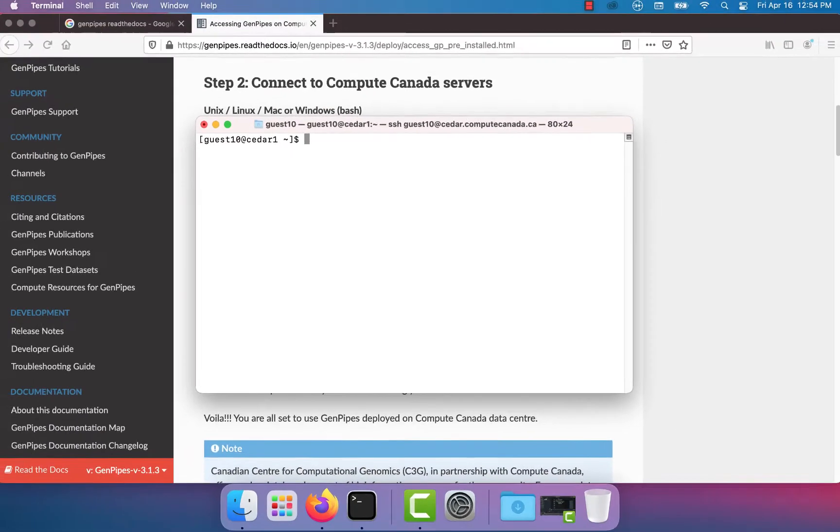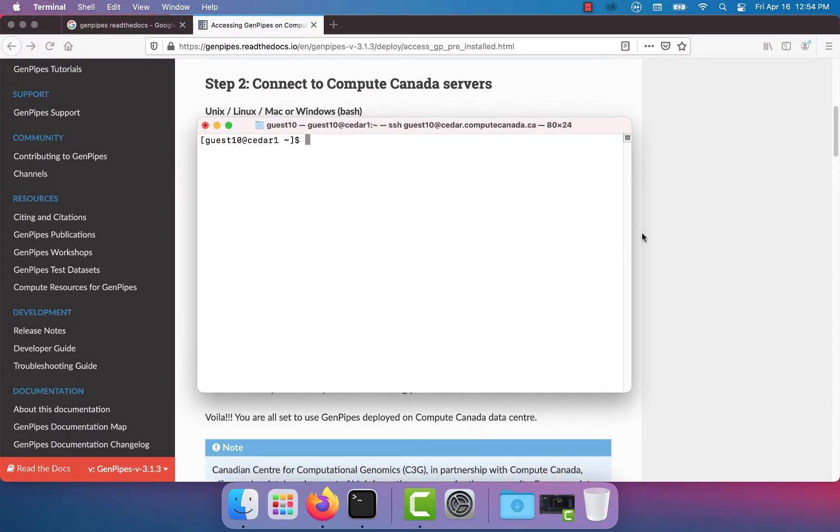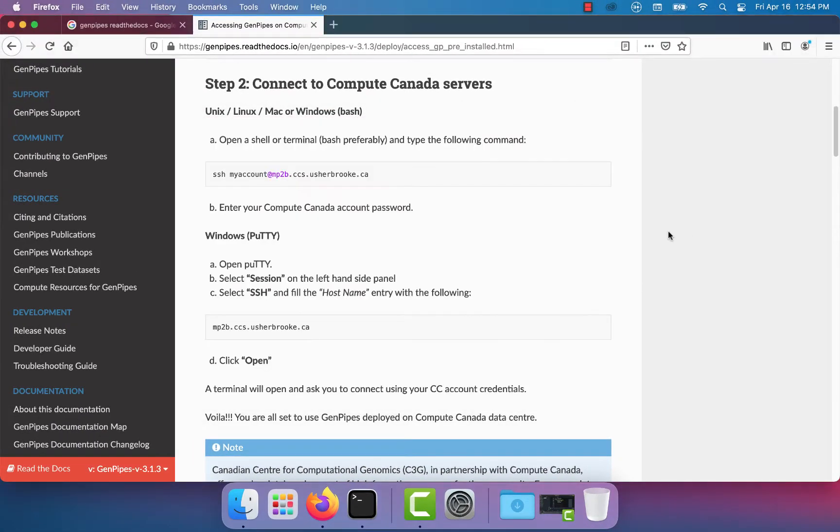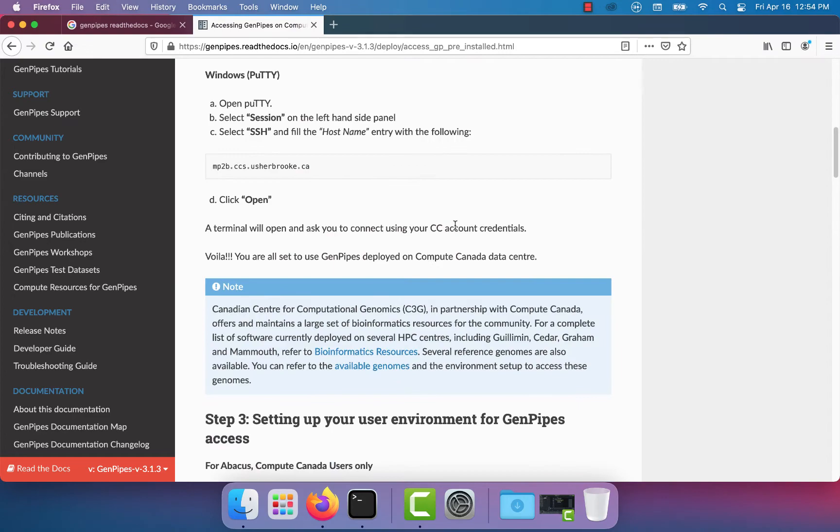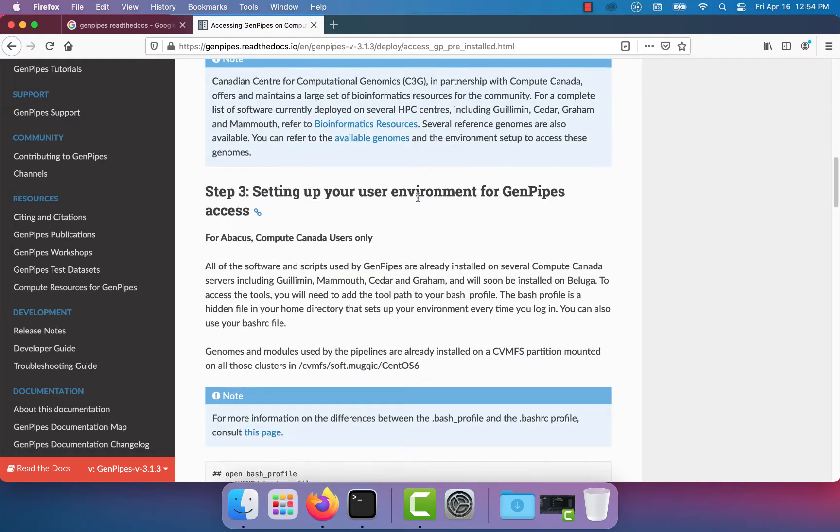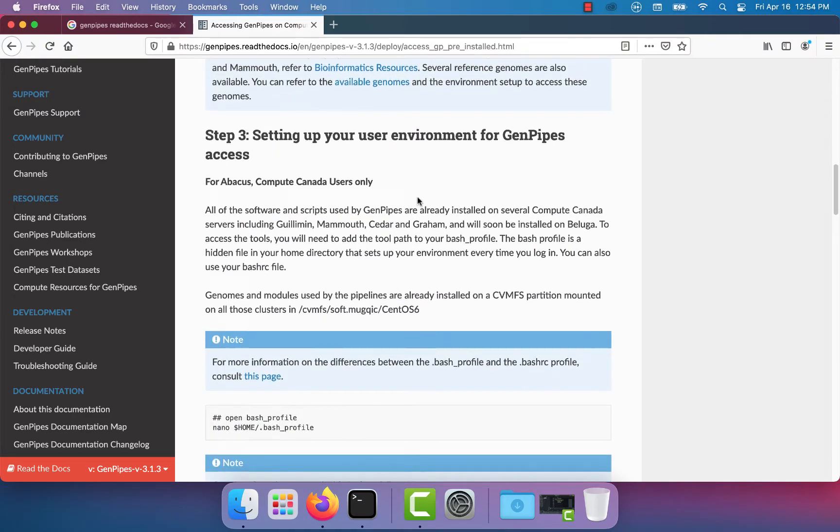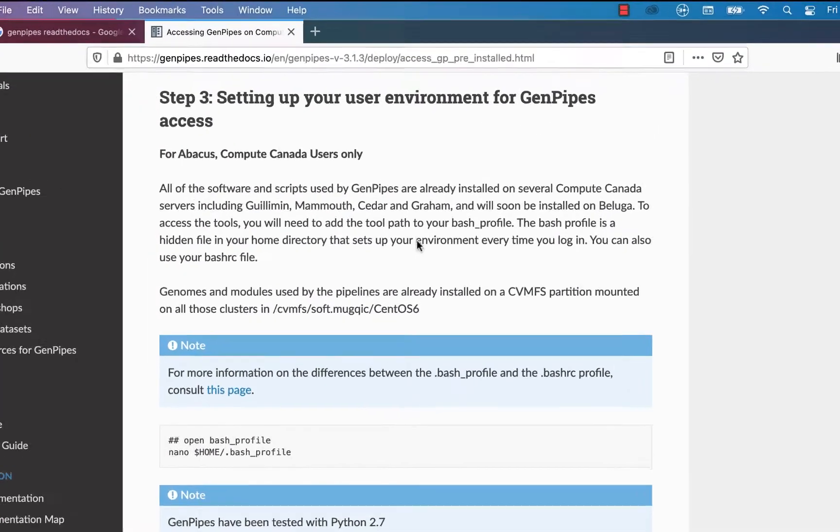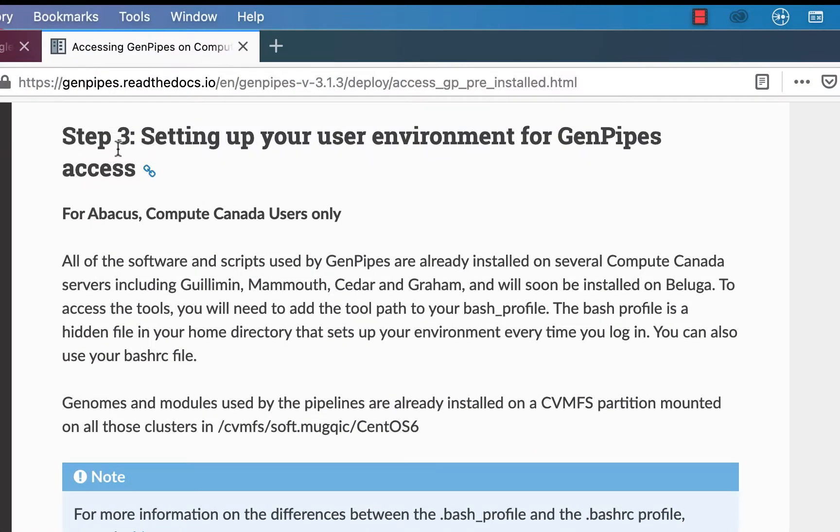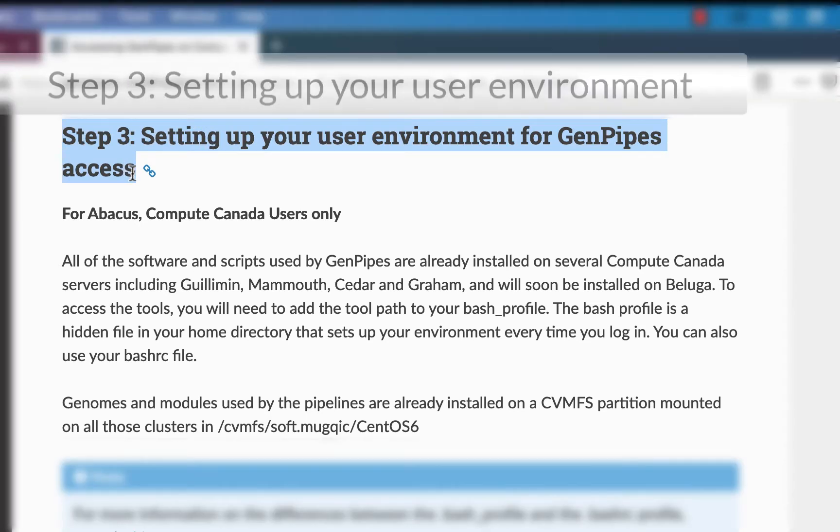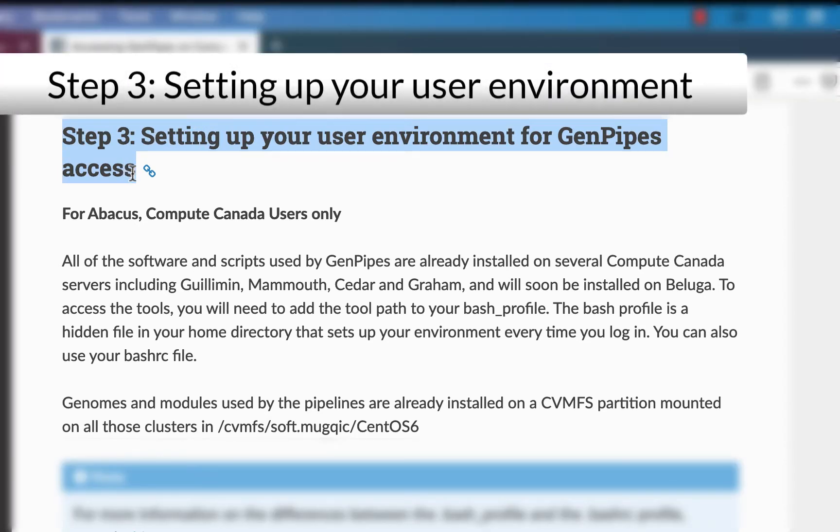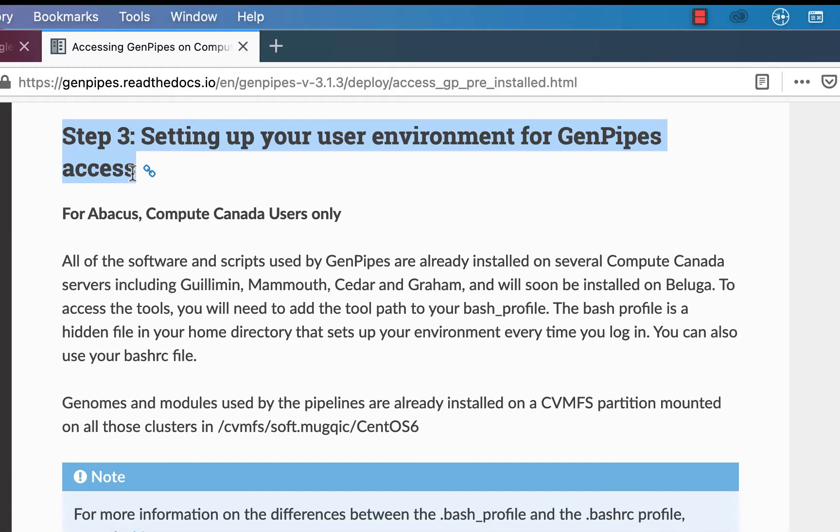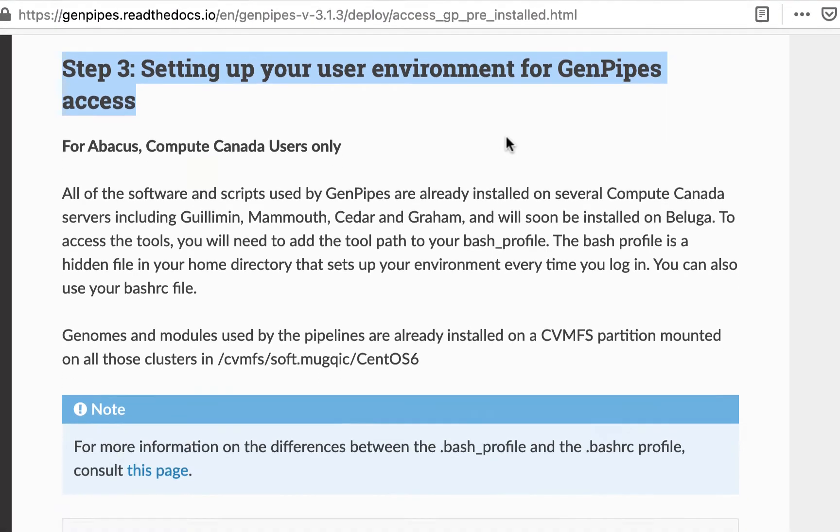After you have logged into the cluster move on to step 3. All the software and scripts used by GenPipes are pre-installed on Compute Canada clusters. You will first need to set up your user environment to run GenPipes. You can start by adding these tool paths to your bash profile.